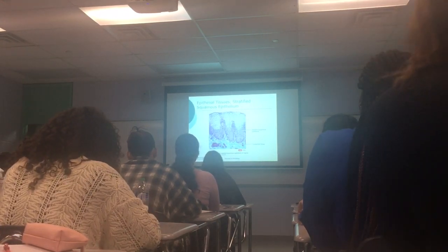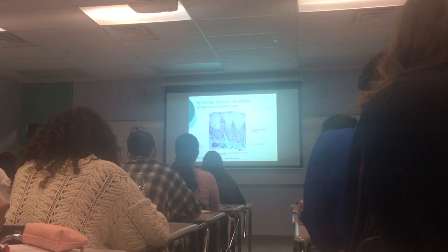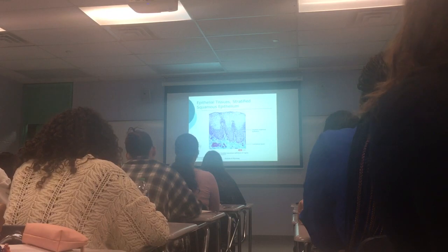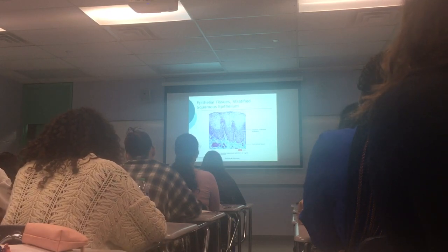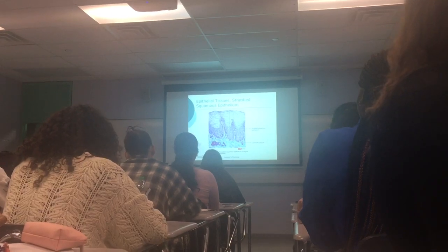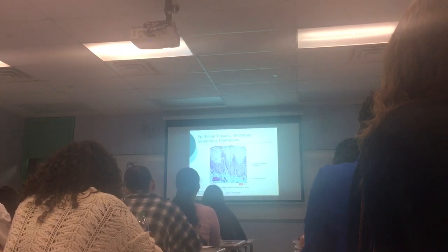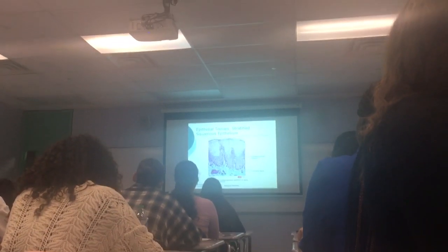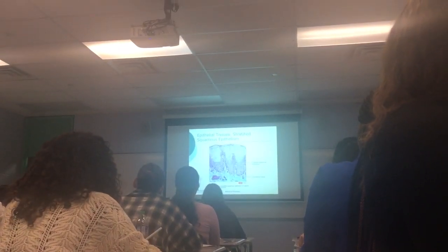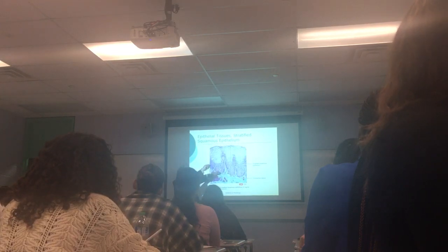Underlying connective tissue, okay? There's only 200 times normal vision, that's why it looks small, okay? But look at these cells, how very closely packed they are together. They're flat cells, okay? Multiple layers of flat cells, okay? It's stratified squamous, okay? This is a vaginal opening here. So what happens here with intercourse, with normal hygiene, washing, you're gonna slough these cells. They're gonna get damaged. So the underlying cells, as these get damaged and slough off, okay, they're gonna be replaced.